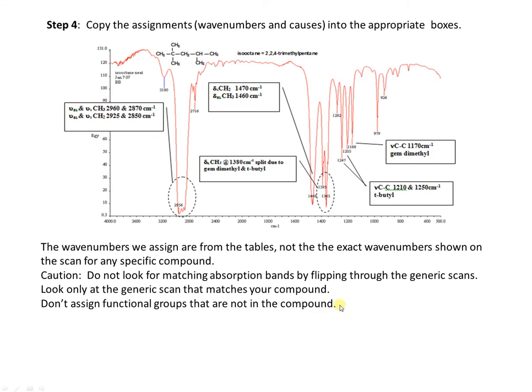If you're wondering about the future, well, at some point in the fifth semester you'll be given an unknown spectra and have to identify it, but at that time you'll be given an IR, an NMR, a mass spec, and a UV absorption, and perhaps other information, and you'll use all of them together to determine it. So at this point you know what the compound is, just find the scan for the compound that you know you have.